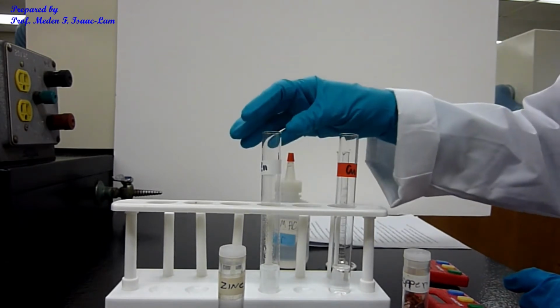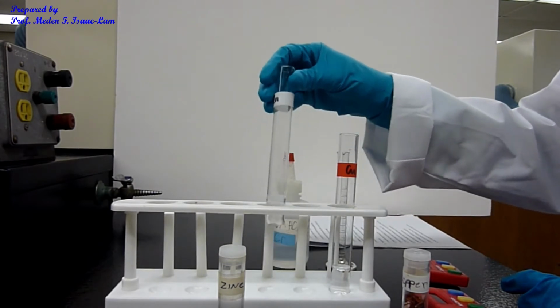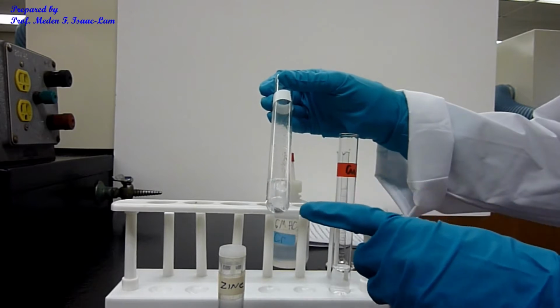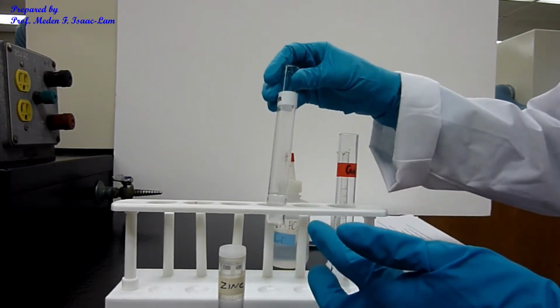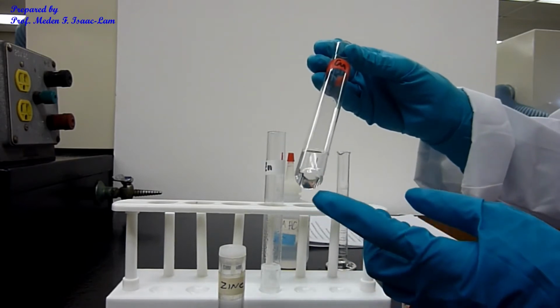So at 1 minute and 30 seconds, it's continuously evolving H2 gas on the zinc and hydrochloric acid. So there was an instant reaction of the zinc and hydrochloric acid. However, for the copper, it's not moving.